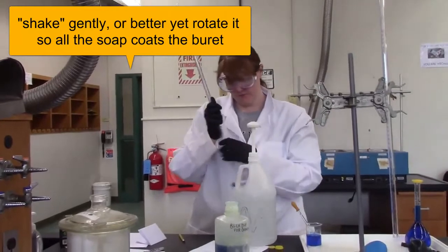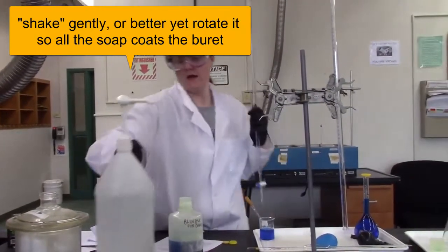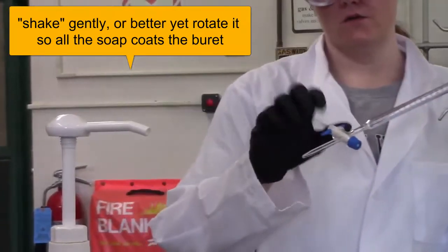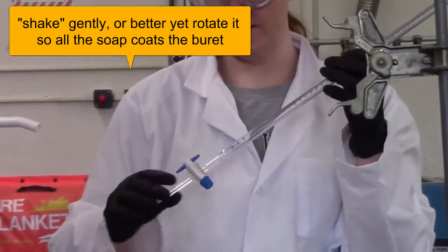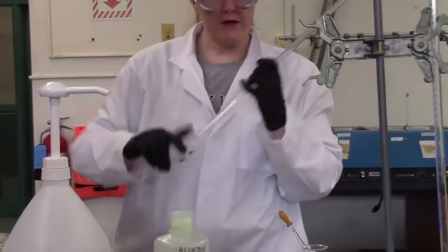The next thing you're going to do is rinse it with some distilled water. You're going to use your squirt bottle to do that. Making sure in all of your rinses that you open the valve and allow the liquid to rinse the valve and the end of your burette. So you're going to do a couple of rinses with distilled water to get the soap out.